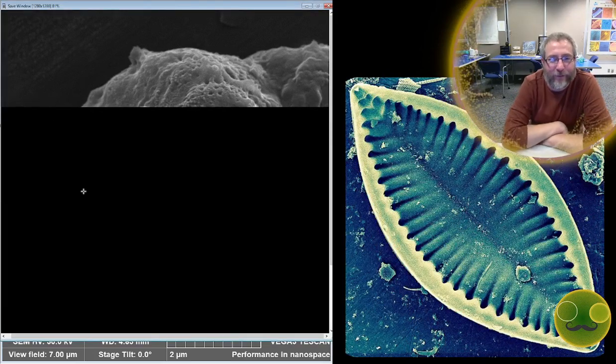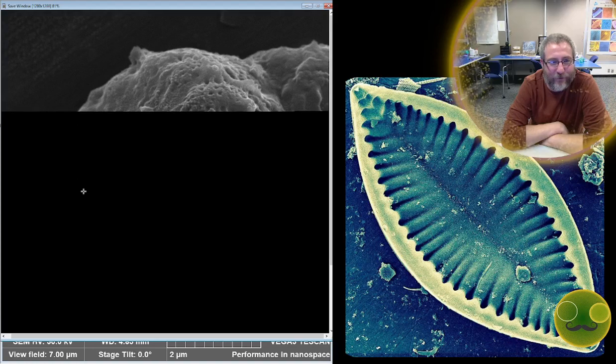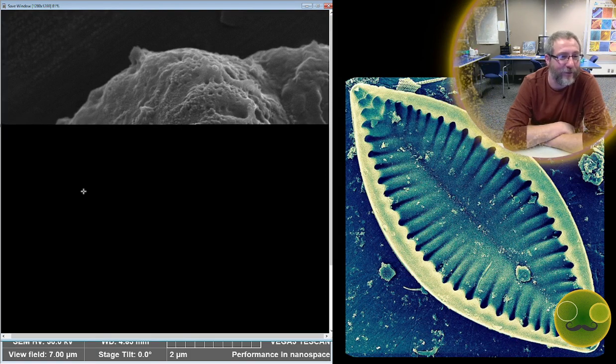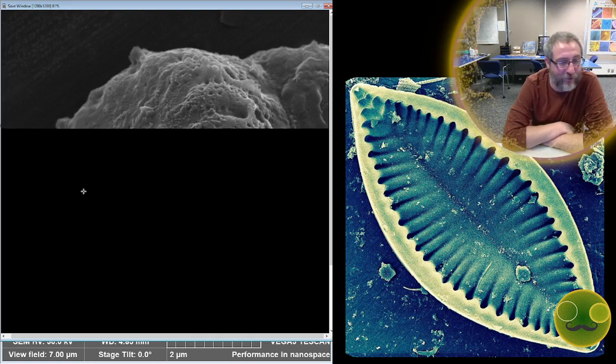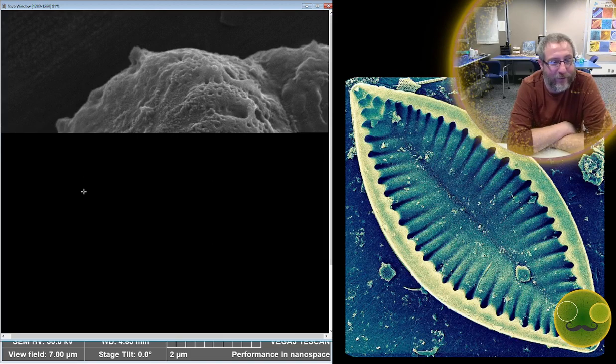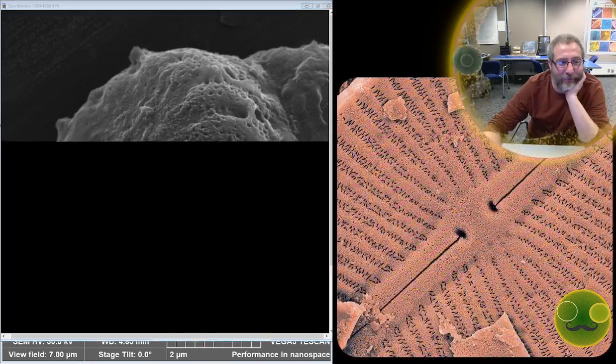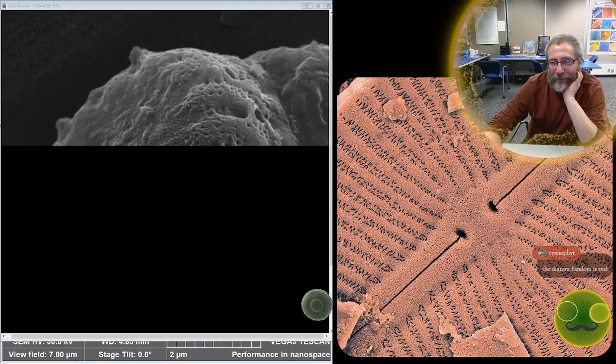I think that they are mostly here for the spectacular imagery that comes from the scanning electron microscope, and I am secretly tricking them into learning about diatoms in the process. But pretty cool. And regularly get these sort of numbers, I guess.